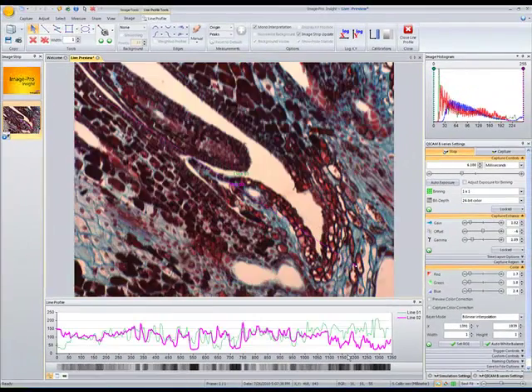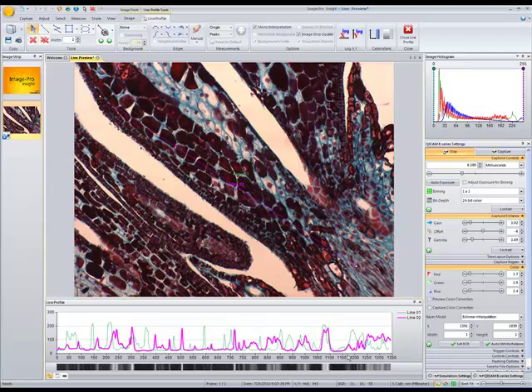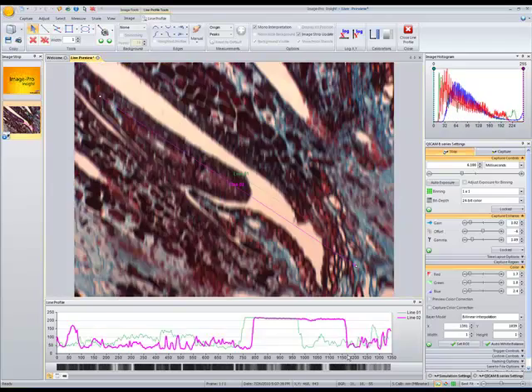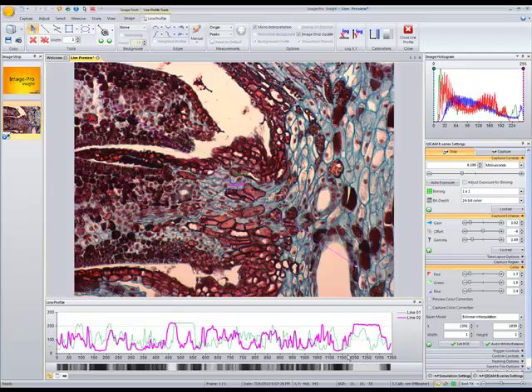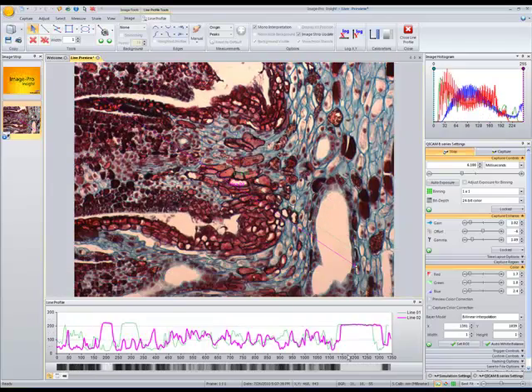And as you move along your image, you can see the profile changes along with it.